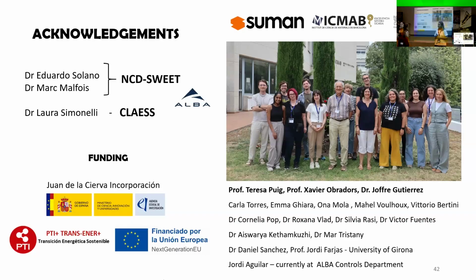And of course, this we cannot do by AFM in situ. So we can only see the final stage, right? And in the final stage, we have all the cooling process, so we have all the coarsening during the cooling and so on. So if we could have access to nucleation densities from the synchrotron in situ platform, it would be a very interesting thing for TLAG and also for the community in general, because it's really a breakthrough. I think it will be difficult. It's challenging, but of course we can get there for sure with some strategies.